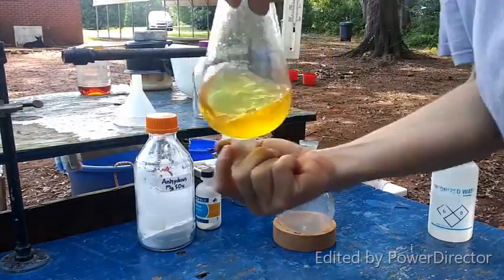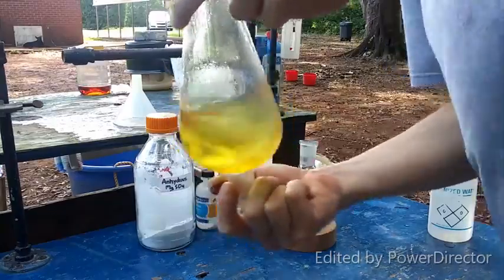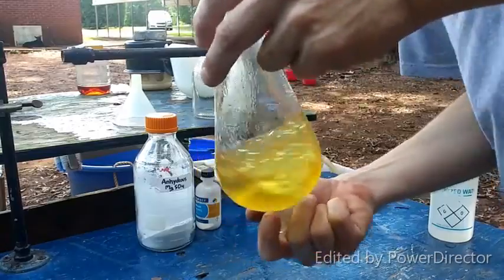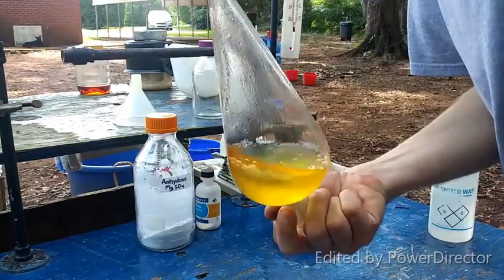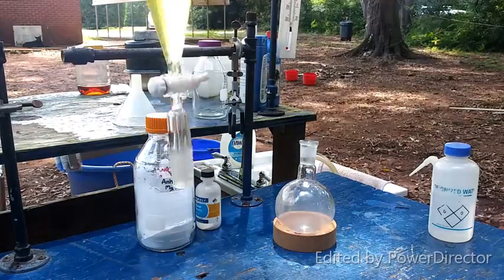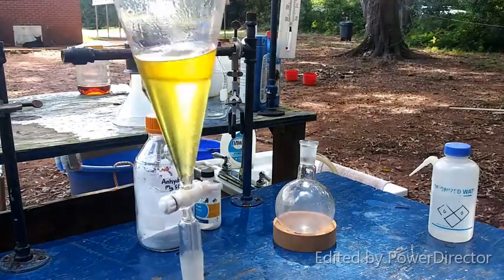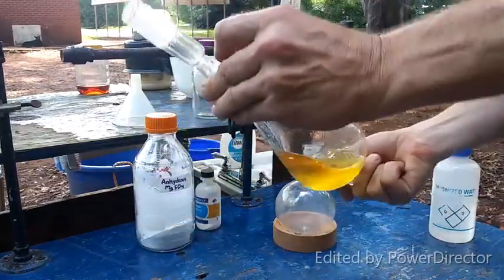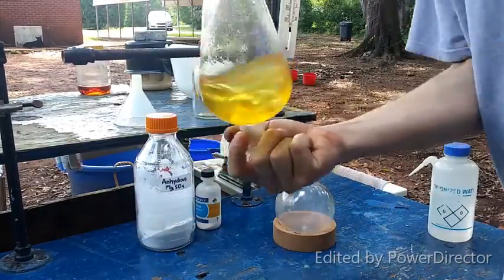I don't want to create an emulsion. That is the last thing I want to do. Okay, there we go. Yay, we got it. Alright. Give it one more little swirl just to make sure we got it all.